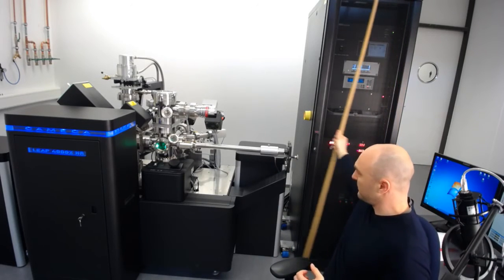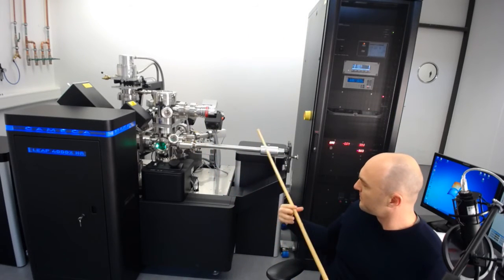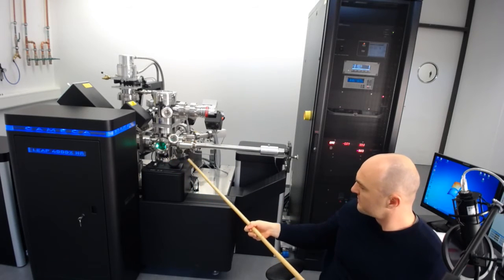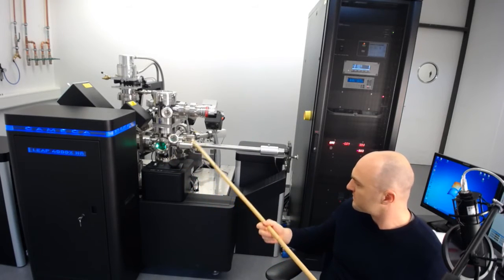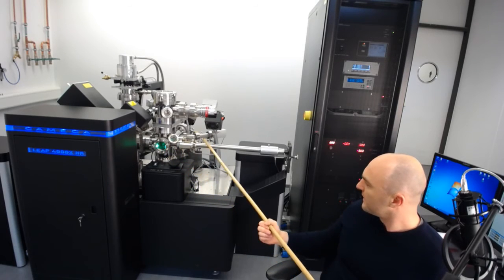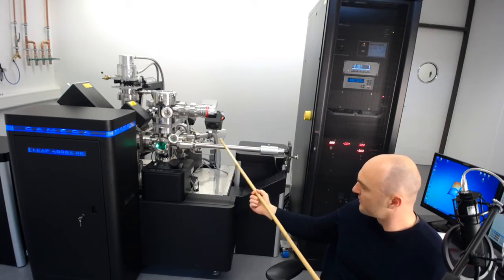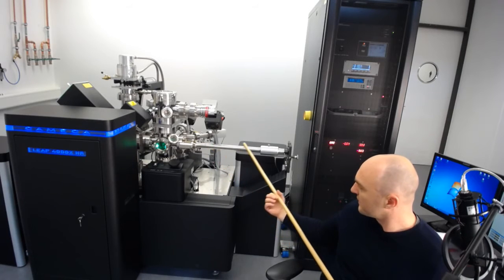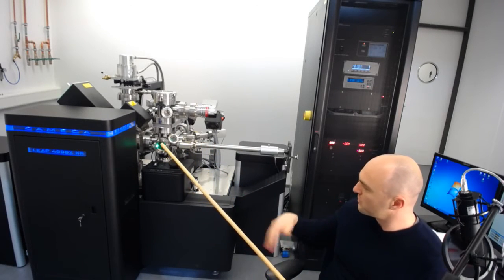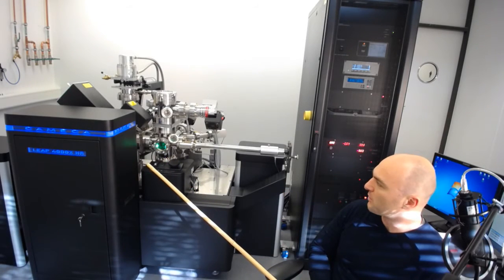Here is a magnetically coupled linear movement rod — there's another one mounted below driven by a motor, but it's essentially the same thing. We've got an outside magnet and an inside magnet, and the coupling goes through the tube here, making sure the system is hermetically sealed. This governs the overall design of the Atom Probe pretty much — we have to have this ultra-high vacuum.